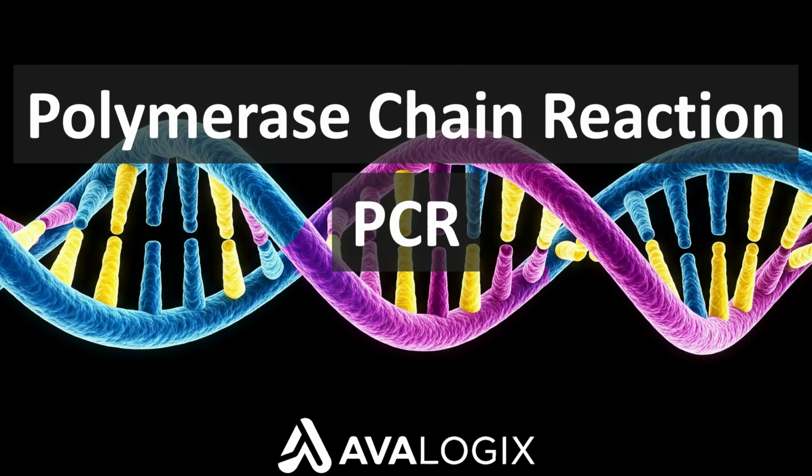Welcome to today's lecture on polymerase chain reaction, commonly abbreviated as PCR. This technique is a cornerstone in molecular biology and biotechnology. Today we'll dive deep into how PCR works, its significance, and how it applies in various domains such as medicine, forensics, and biological research.